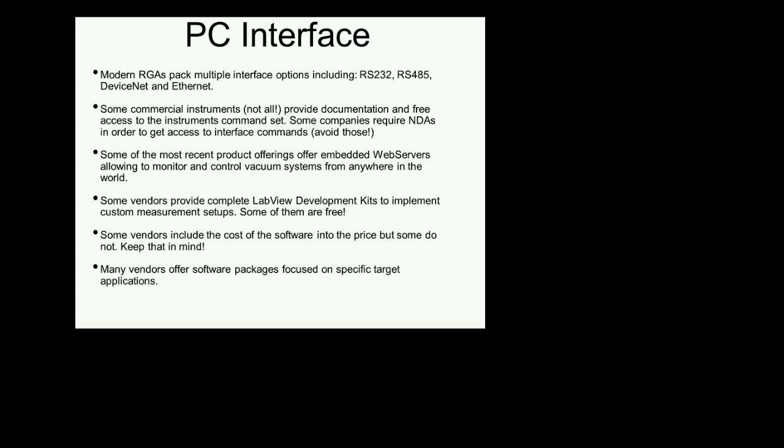In terms of interface, as we said, the ECU then has to connect to a computer. There are all kinds of interfaces today: RS-232, RS-485, DeviceNet, Ethernet. There are converters for all of these things. I don't have much to say other than, in terms of recommendation, I would always use the fastest interface that you can find.